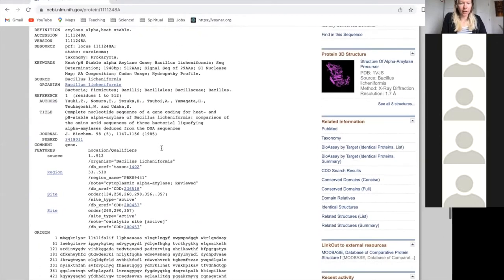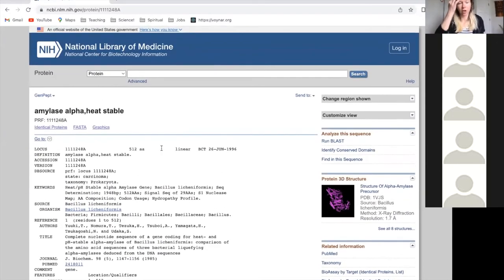So just being able to interpret the information that is here is, I think, part of the battle, knowing how to answer these questions. If I wanted to know the first three amino acids of this sequence, what would I click on this site here? FASTA. Yeah, exactly, FASTA.